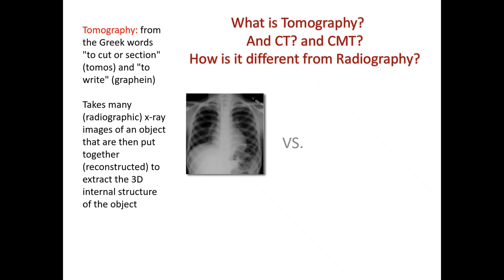So when we refer to CT, it's not just tomography, it's not just an image that I got as a result. I have to take all of those images and compute something to reconstruct a three-dimensional image. So that's what the CT part refers to, computed tomography.